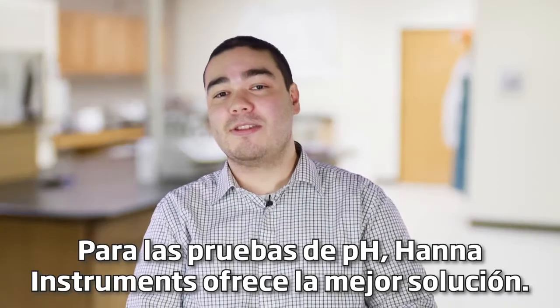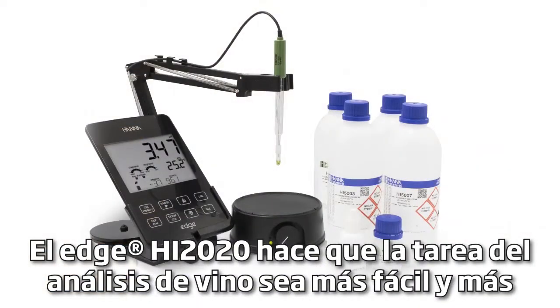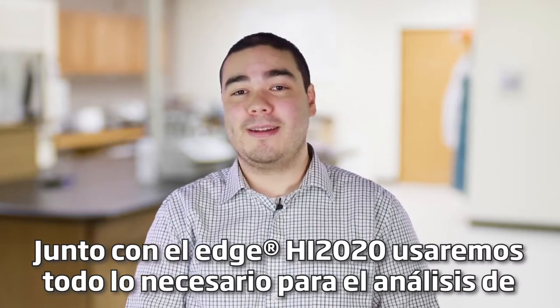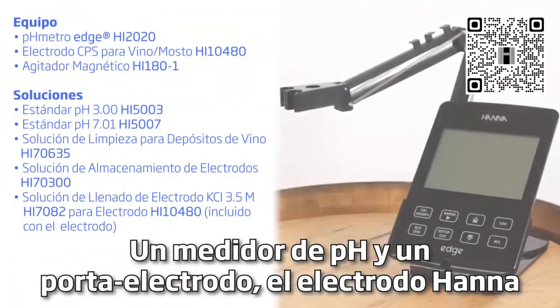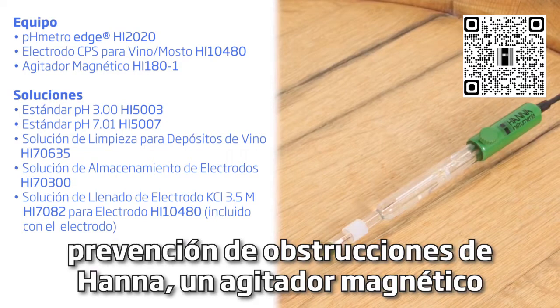For pH testing, Hanna Instruments offers the best solution. The HI 2020W Edge Wine Kit makes the task of wine analysis easy and more reliable than any other method. Your Edge 2020W Wine Kit comes with everything you need for wine analysis: a pH meter and electrode holder, and the Hanna HI 10-480 electrodes specialized for winemakers with Hanna's clogging prevention system.